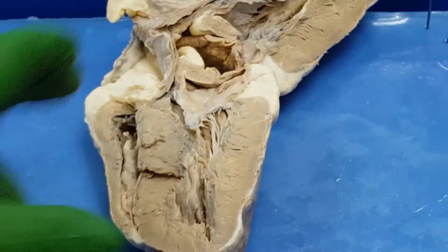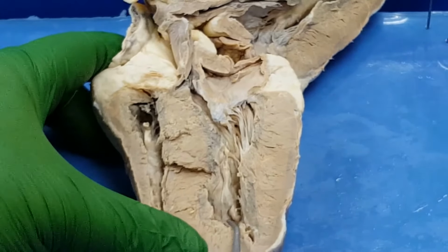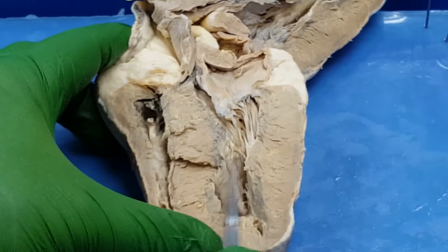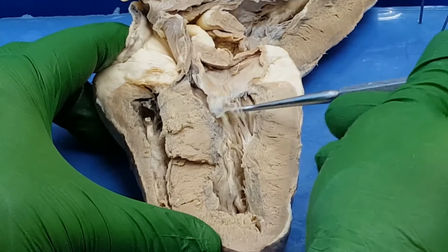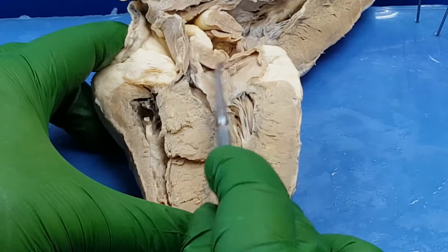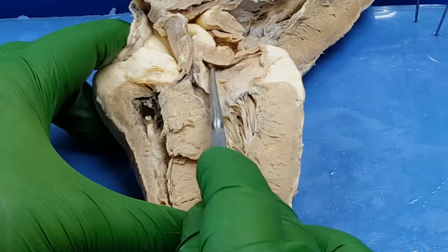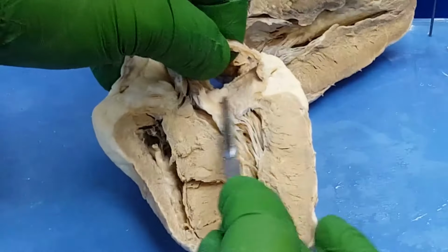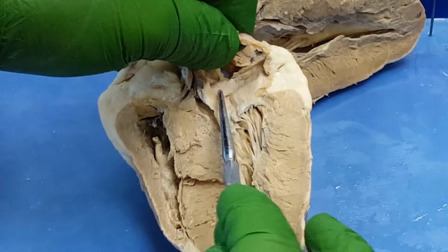So as I open up this one, just because of where it's cut, this one's a little easier. So left ventricle, right ventricle, cords, mitral valve, and then above it, right here, this is literally it, where my probe is. Let me move this little flap of myocardium out of the way. This is the left atrium, right here.